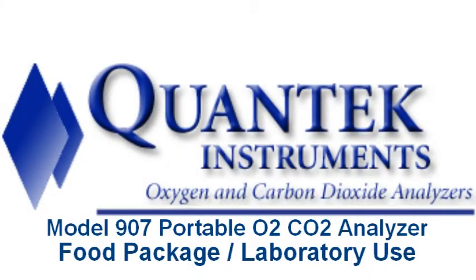The following is a video demonstration of the Quantek Instruments Model 907 Portable O2 CO2 Analyzer for food package or laboratory use.